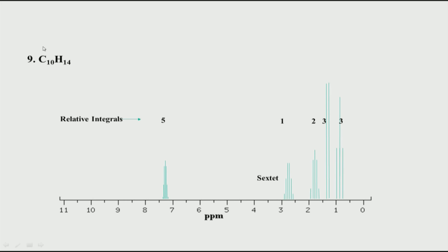Now the first thing is, how do you know there is an aromatic ring here? Remember, in chemistry there are rules which can tell you whether there is an aromatic system. We use what is known as the index of hydrogen deficiency, which we will not go into in this course, or you can use what is called the rule of 13. These are the rules which chemists typically use to figure out the number of pi bonds, that is, the degree of unsaturation and so on. So that is one way to find out if there is an aromatic benzene ring present.